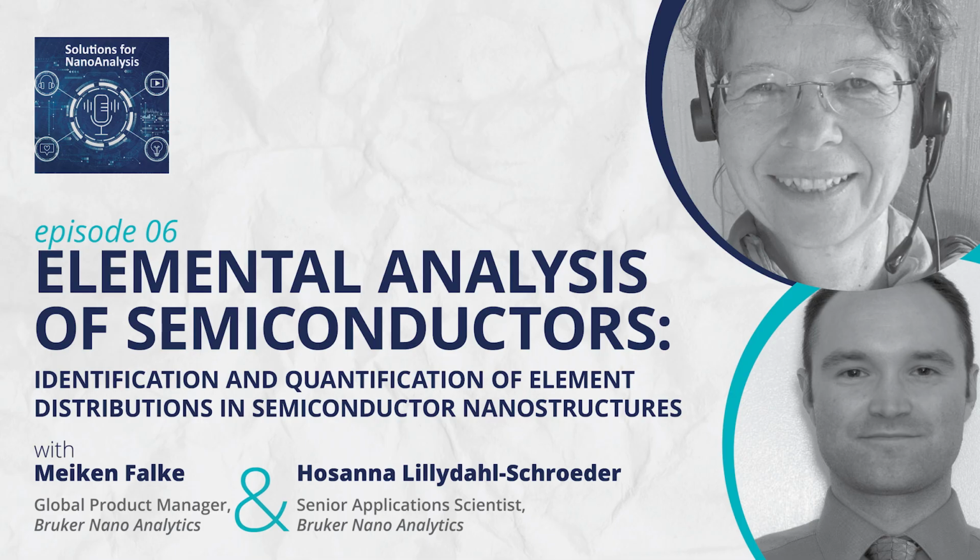I am called Global Product Manager EDS, and that means I'm responsible for energy dispersive X-ray analysis on electron transparent samples or specimens with really small structures, nanostructures. And the responsibility within Bruker includes everything connected to product management. So application, R&D, hardware, software development, bringing the developments to market and make sure that we stay on track with what we do next. I joined in 2008, so it's quite a few years now. And it was always sort of on the same topic. Starting as an application scientist, but very quickly I moved to product manager.